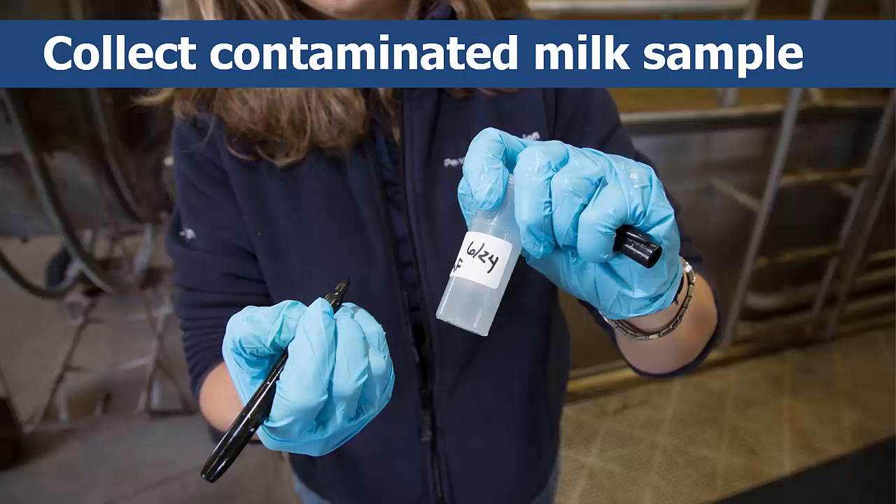To begin the culture, you'll need to collect an aseptic sample of milk. Start by labeling the test tubes — mark each tube to keep track of which sample it contains. Use a marker to write which of the cow's quarters is being sampled: right front (RF), right rear (RR), left front (LF), and left rear (LR), as well as the cow's identification number or name and date.